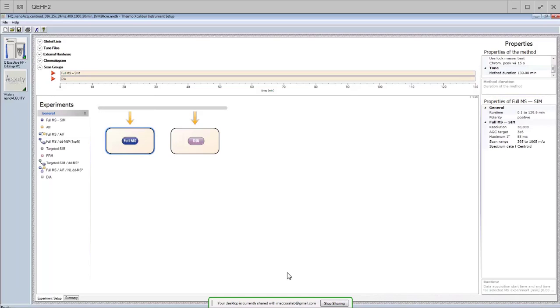Okay. So this is basically just the straight method editor here on the QE. How many of you have QEs versus Lumoses or Fusions? Okay. And then everyone else has a Fusion or a Lumos? Amazing. All right. You guys are rich. So on this older style method editor, it's not as fancy as the Lumos method editor. There's a bunch of sections here in which you will acquire data of different types.